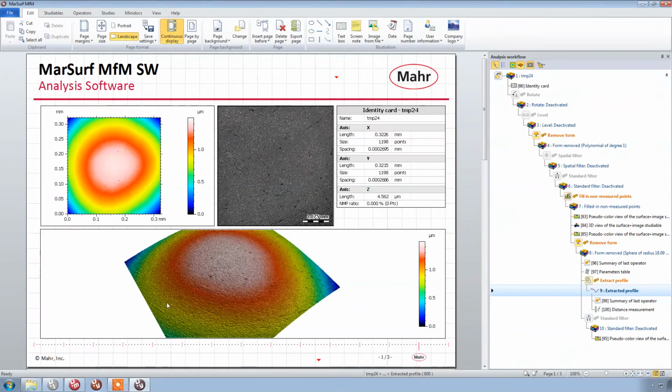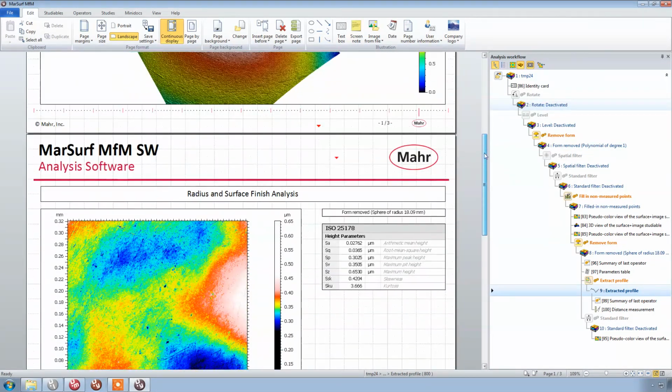The surface finish is very uniform, but it's not really mirror level. It's a very, very fine polish. But the interesting thing to me was just the level of waviness on this spherical part. And we'll see when I move down to the second page.